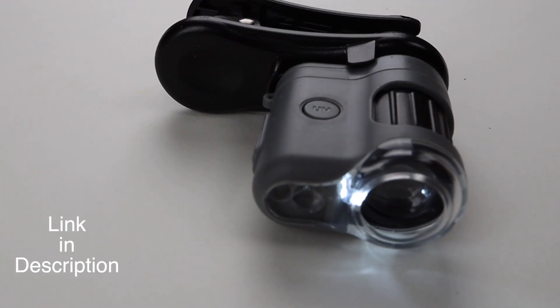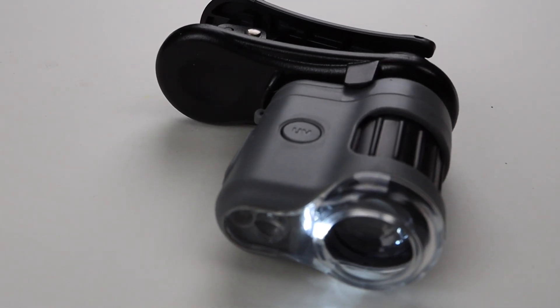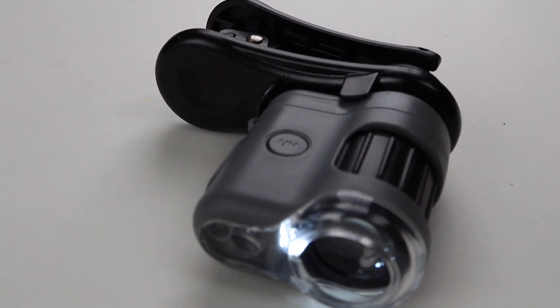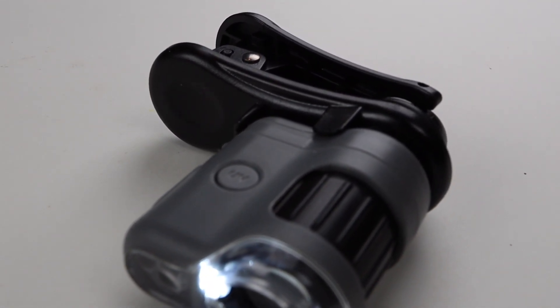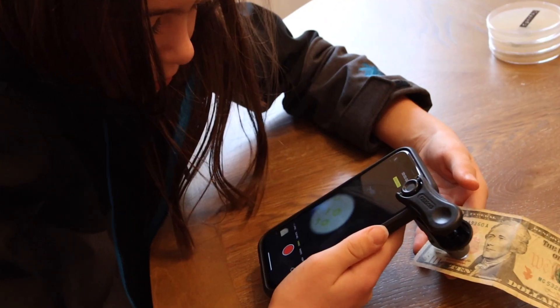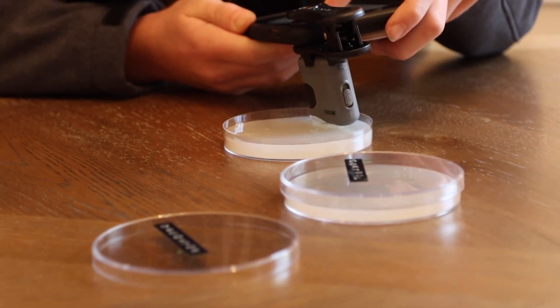Today we're going to be reviewing the Carson mini pocket microscope, and it also comes with a phone adapter. This microscope comes with a UV light, an LED light, an independent focusing ring, and an attachment clip that you can put on almost any cell phone. You'll be able to magnify all kinds of things around the house — everything from money to insects and much more.